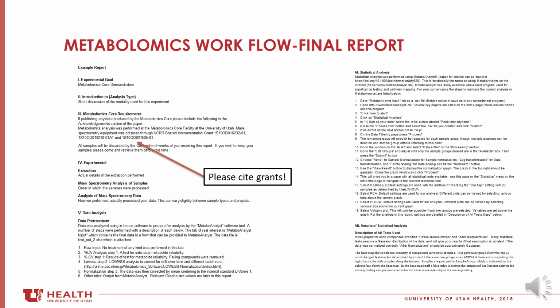Now, another thing this report has is if you want to do the statistical analysis on your own, we have detailed step-by-step instructions that you can mimic for the data processing that you'll see further through this report. And also, we include a description of all the tests that we've used to determine alterations in your samples.